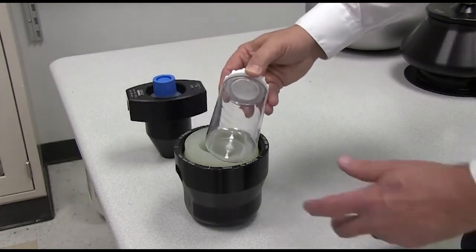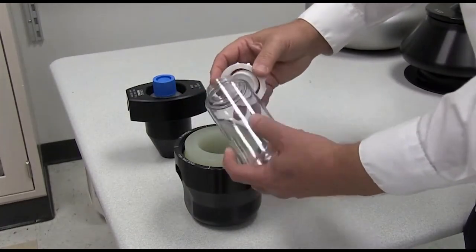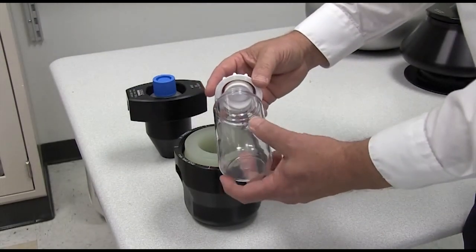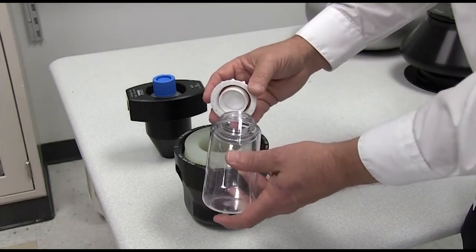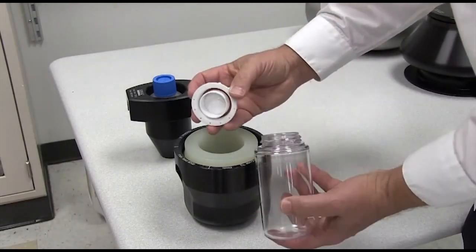And this is a centrifuge bottle. You can see it's made out of a plastic capable of handling at high speed. And it has even a gasketed cap so that the actual liquid that's in there helps contain it.